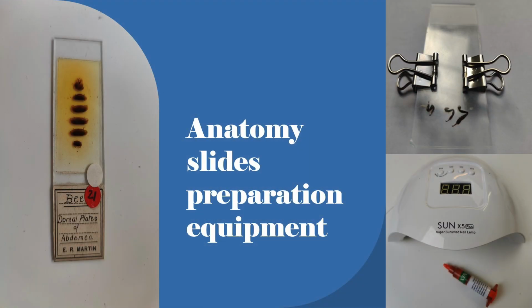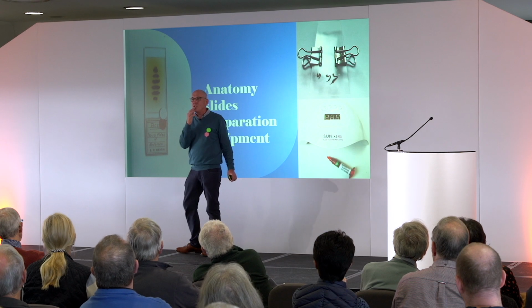This is how you flatten. You put your 3 legs on between 2 slides and a couple of paper clips, and then you immerse them. But I cheat. This one here, this slide here, you don't have to do things which are on the microscopy assessment syllabus. You can do whatever you want. This one's a neat one. These are all the segments, the dorsal plates of a bee. And that is decades old. And that's what you call a permanent slide. You choose things that you want to do.